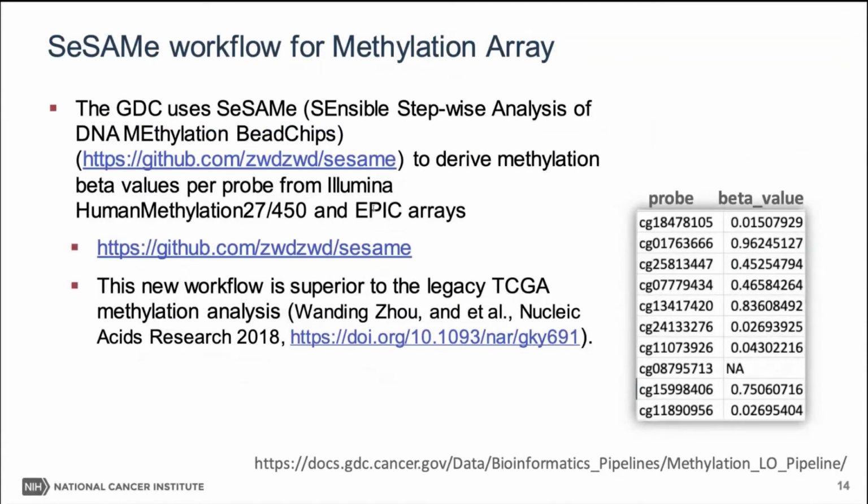We have used a completely new workflow compared with what TCGA used. This workflow was actually developed by the same lab that analyzed the classic legacy TCGA data, and it has much better probe QC and much better accuracy in terms of the output. So this is definitely superior to the legacy TCGA methylation analysis. You can read this paper. It will also describe how they did it differently and why it's much better.